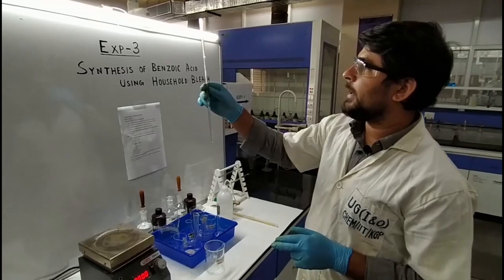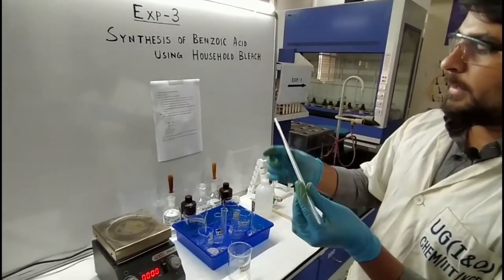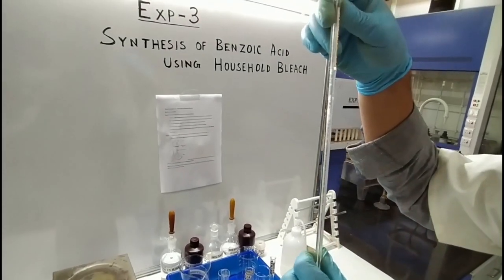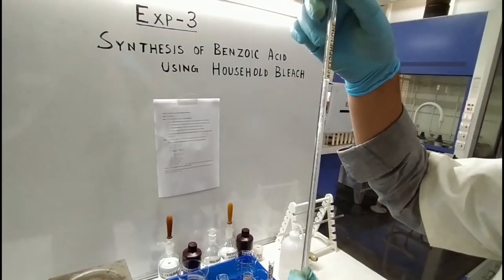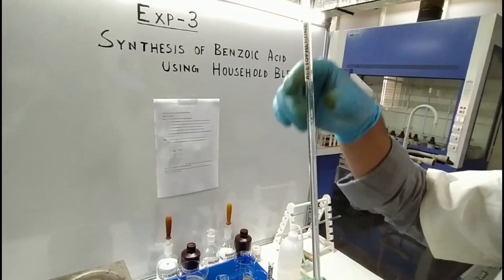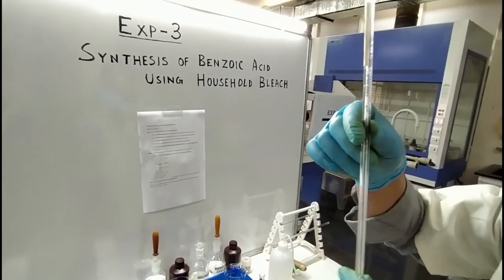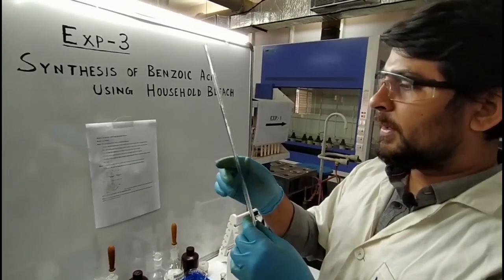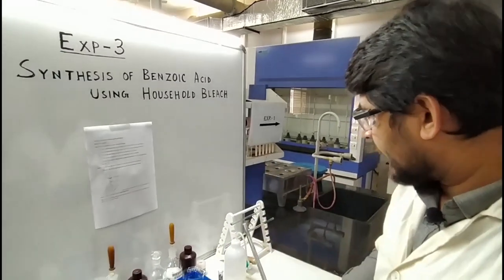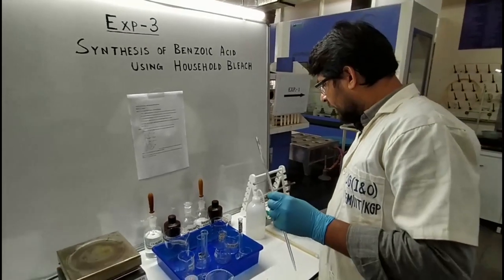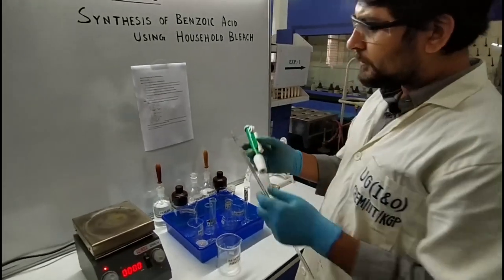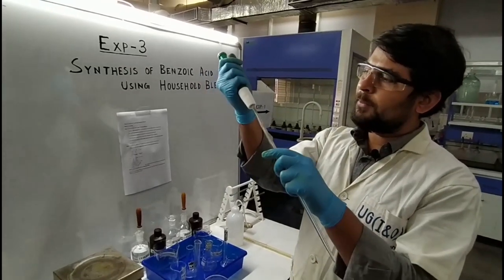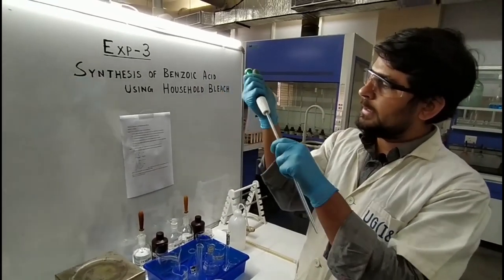Here you can find a pipette — this pipette is exclusively for acetophenone, and this can measure only 1 ml. How much is needed? 0.72 ml. So I am going to take 0.72 ml of acetophenone. This is the pipette, and this one is the pipette pump. First of all, we have to install it like this.